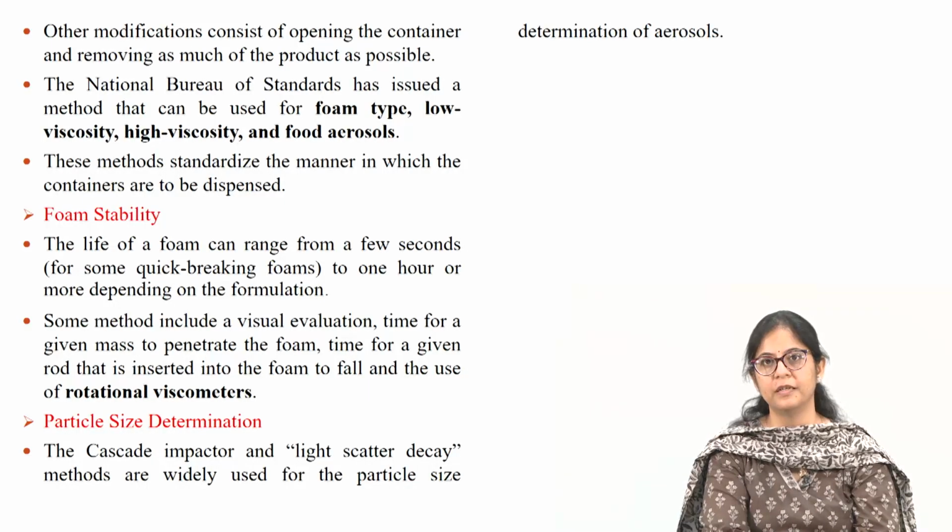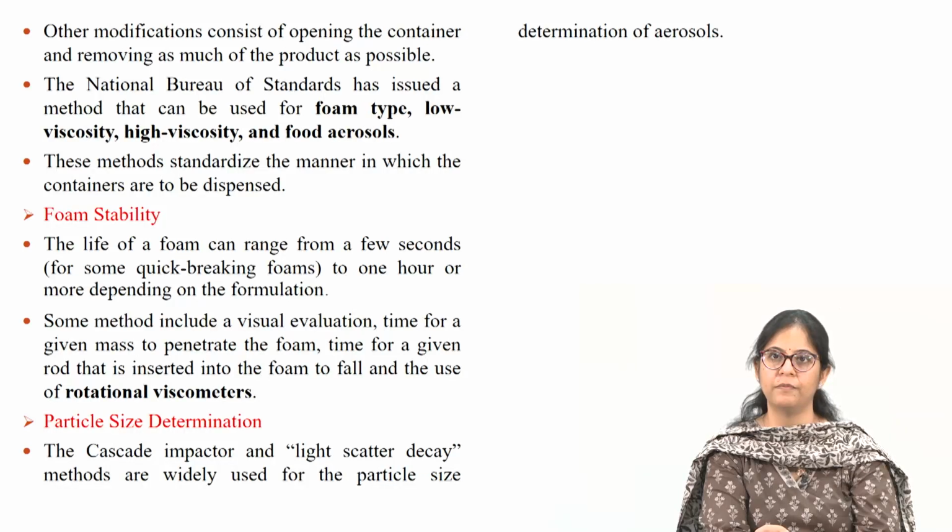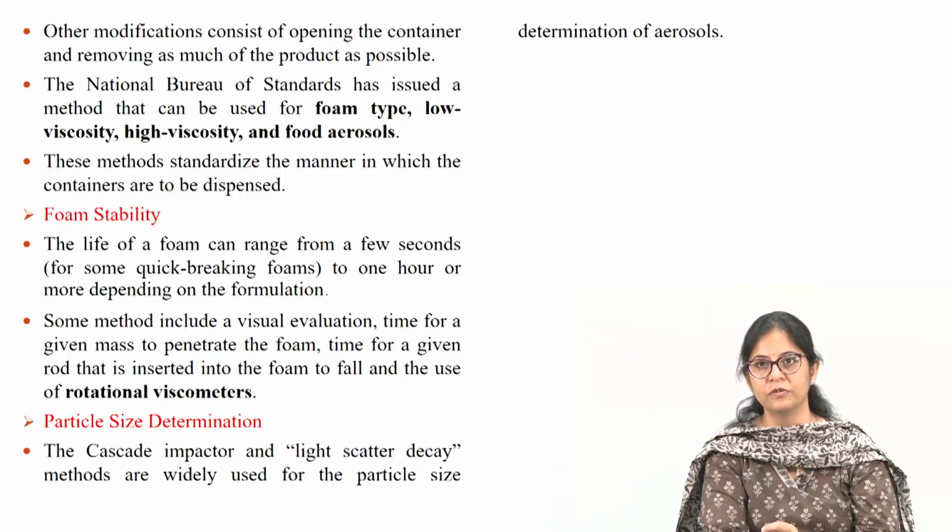Foam stability. The life of a foam can range from a few seconds for some quick breaking foams to 1 hour or more, depending upon the formulation. Some methods include a visual evaluation, time for a given mass to penetrate the foam, time for a given rod that is inserted into the foam to fall, and the use of rotational viscometers.